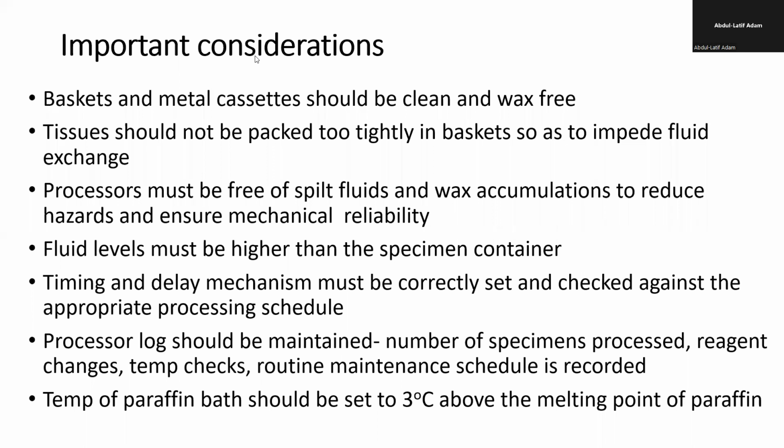Okay. And then another thing that has to be considered so far as processing is concerned is keeping a logbook for all the reagents. So if you change a reagent today, you note it, that today I changed the reagent.